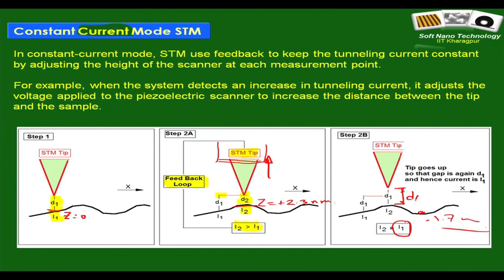Here you do not rely on the magnitude of the tunneling current, because you need to feed an error, and the error from one point to the other, because you have a feedback loop, is again the variation of the tunneling current as the tip moves from point 1 to point 2. At point 2 initially the magnitude of the tunneling current is I2, but once the feedback loop gets activated, it is again back to I1. So, again when the tip moves to point 3, one is going to compare the difference in the magnitude of I3 with I1, and accordingly the tip will move.